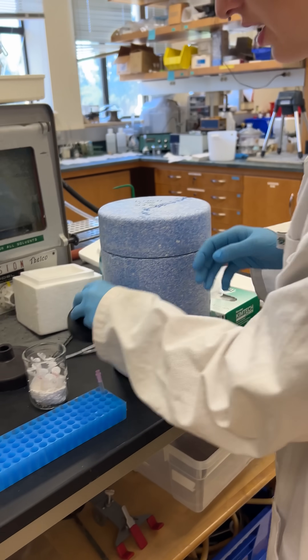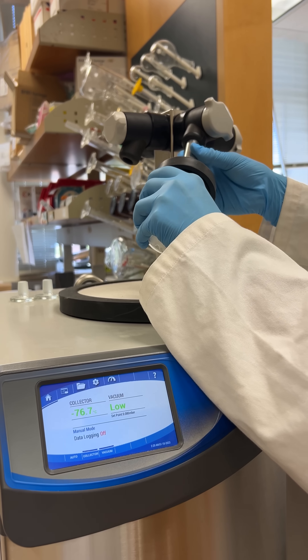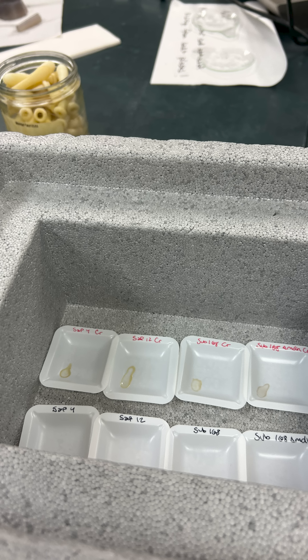We can then use that to test our samples and compare them to the ones that are drying right now, which are making a film. So we'll have a powder for these and then we'll have a film for the other, which we can use for the IR.